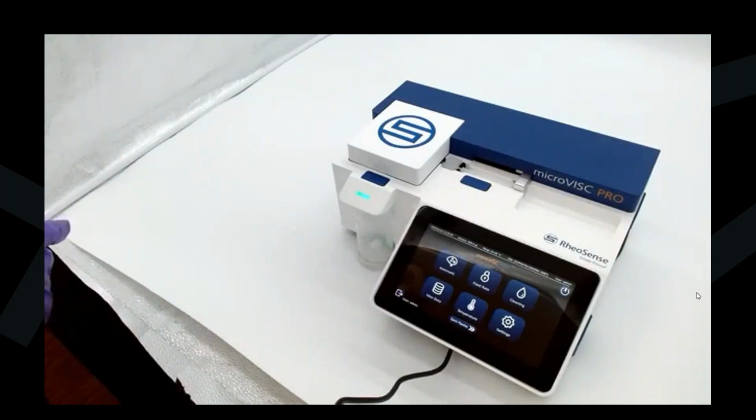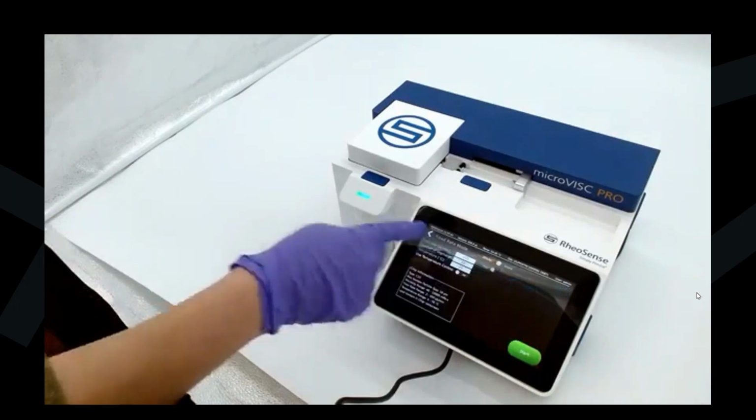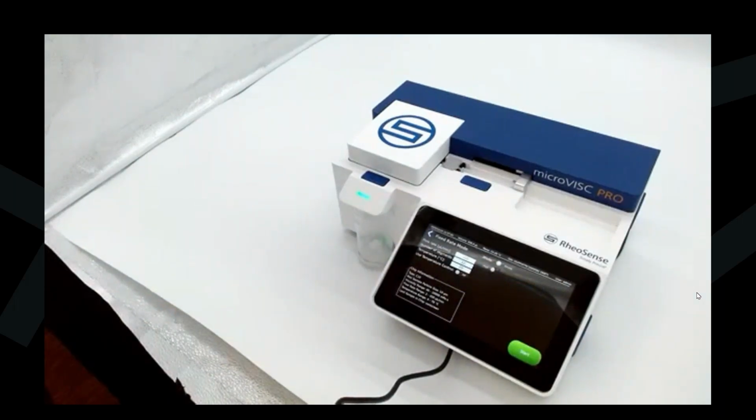There's also another option for fixed rate. So in this case, you can select the shear rate. You have control of the shear rate or flow rate that you want. So you input the flow rate. The rest is the same as automatic mode. You enter the number of segments, the temperature if you wish, and then you hit start and it measures your sample at that specific rate that you entered.